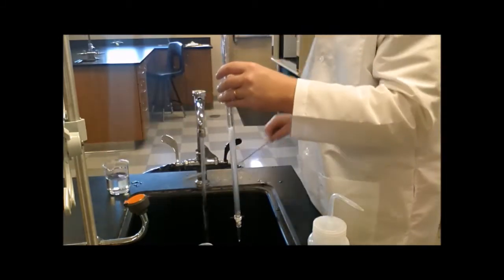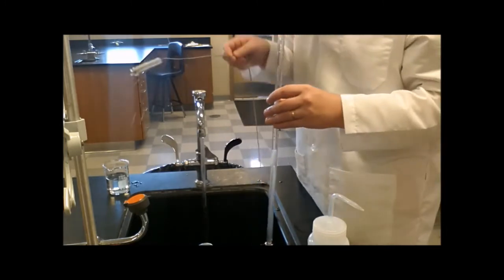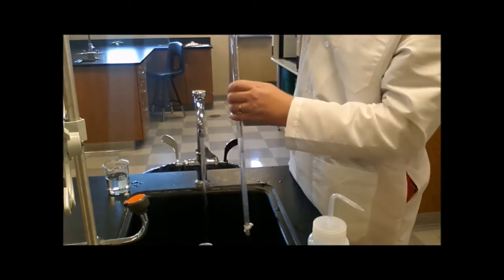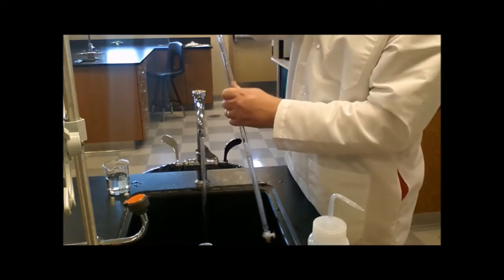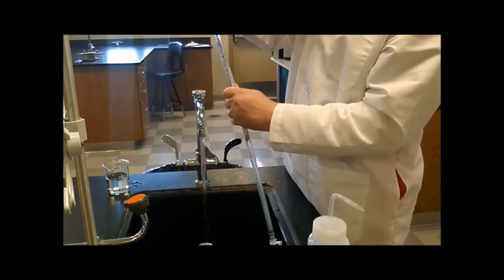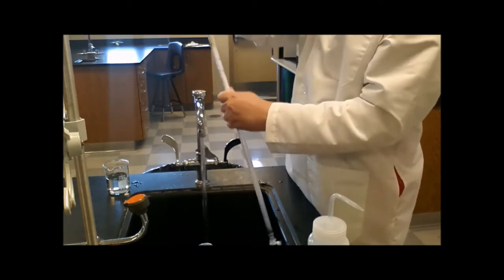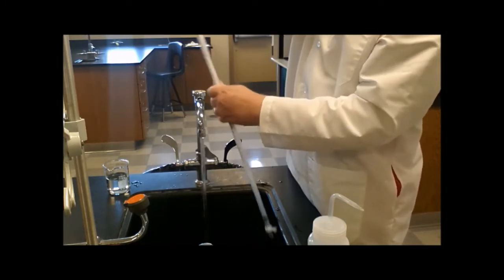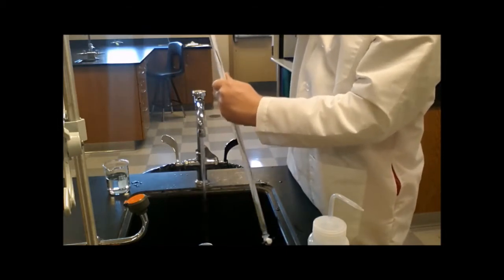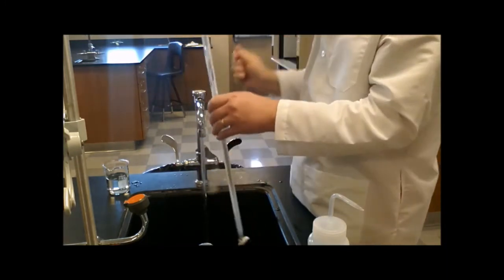Then I'm going to take this Buret bristle brush here, kind of a little test tube brush, but on a really, really long wire. And I insert the bristle brush into the Buret. The wire bends, so you can bend the wire if it's the wrong shape. And then I'm just going to scrub out the Buret with the wire brush. Nice, sudsy, soapy water.